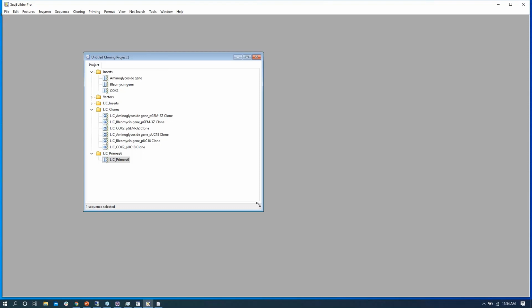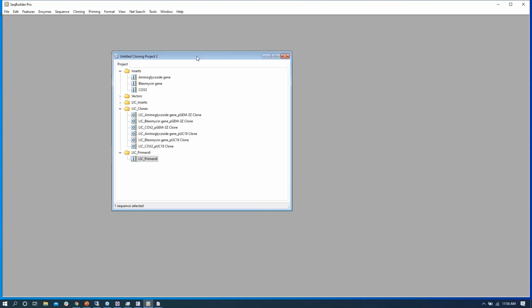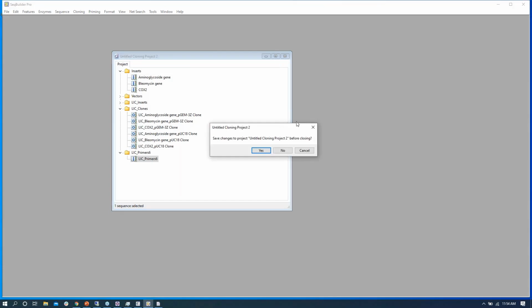If there are any questions at all with batch clone, I'd be happy to take them before I move on to a few genomics things. No questions on cloning at this point. I do see a couple questions coming in on things for SeqMan and MegAlign. I think we'll follow up with people after the webinar so that you can go ahead and show those genomics features, Matt. Okay, great.